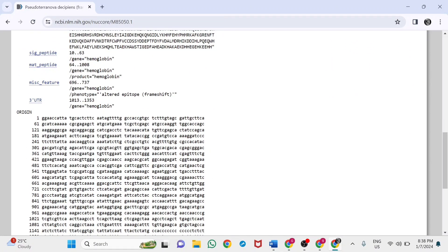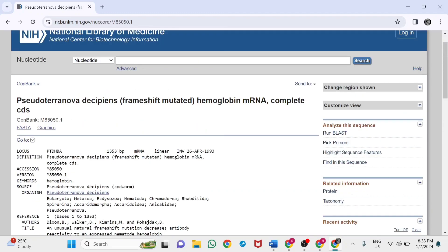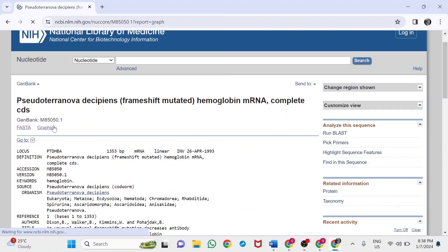This is the format of the sequence. You can also visualize the sequence in graphical format. Click on graphics.